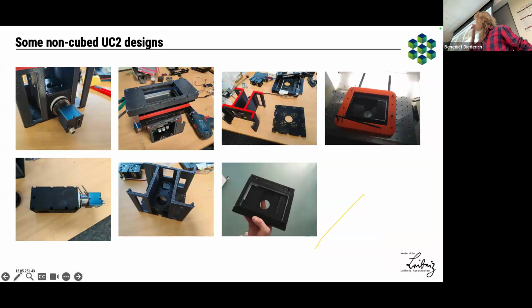And so we built these microscopes that were fully 3D printed, but having the same idea of having a stage and then a microscope, still somewhat modular. We literally bought €100 XY stages, put them in a CNC machine, and carved out the parts that were not nice for us because we wanted to scan these multi-well plates, and then had a very cheap microscope, which unfortunately we weren't really happy with. So we went back to the cubes, and now this is what we have.